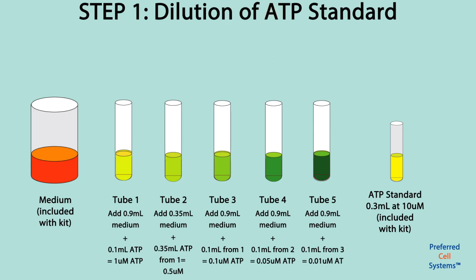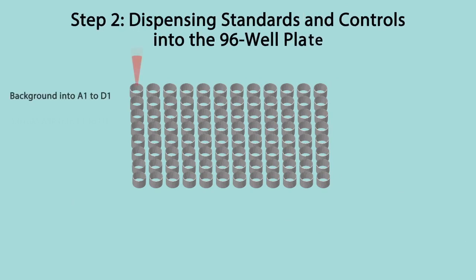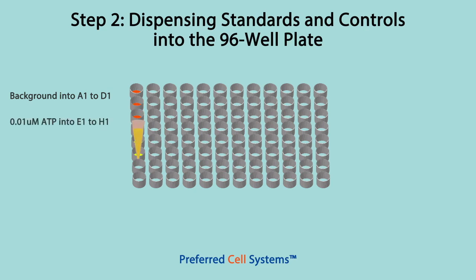You have now completed the first step of the procedure. We are now ready to set up the 96-well plate with medium, ATP standard dilutions, and controls. We are going to fill the first four columns of the non-sterile 96-well plate — each data point will consist of four replicate wells. Using the small volume pipette set at 0.1ml, transfer 0.1ml of the medium into the first four wells of the first column: wells A1, B1, C1, and D1. Make sure you change the tip after dispensing the medium. Starting with the lowest ATP concentration, vortex the vial and transfer 0.1ml of the 0.01 micromolar ATP standard into the next four replicate wells of the first column: wells E1, F1, G1, and H1. From the fourth vial containing 0.05 micromolar ATP standard, vortex and transfer 0.1ml into the first four wells of the second column: A2, B2, C2, and D2.